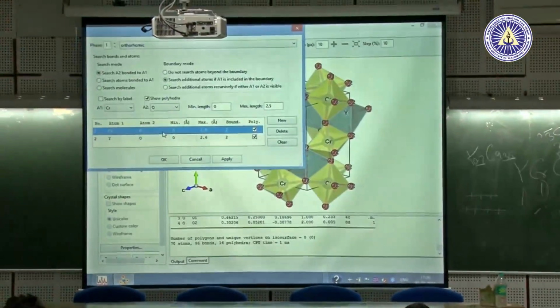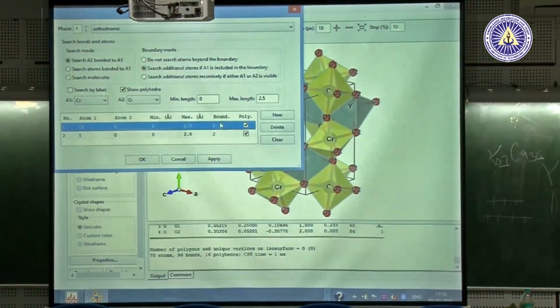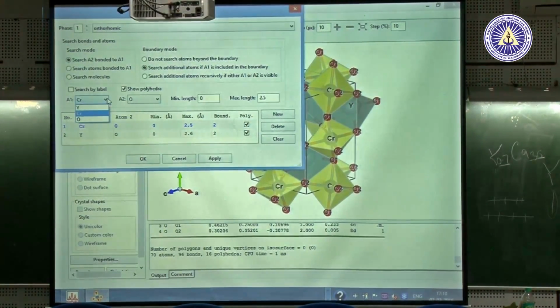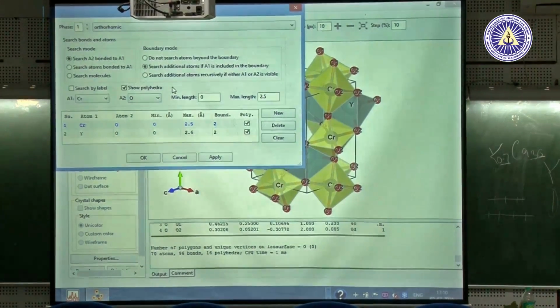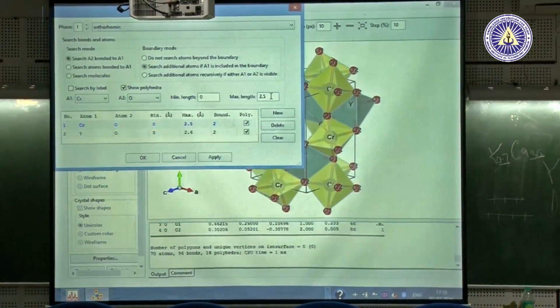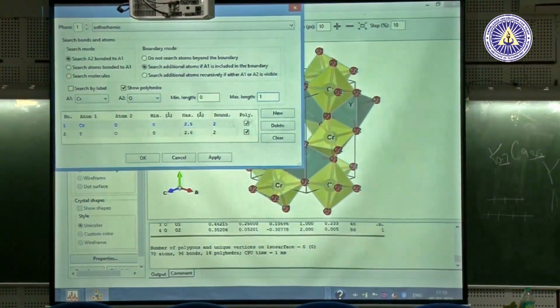Or suppose you can't expect, so you just increase the number. Like here, whatever you put in the database, yttrium, chromium, oxygen will come out here also, and for whichever pair you want the bond length or bond angle, just select here. Like I select here chromium and oxygen, the minimum take 0 and maximum I do not know, I put 1 here.